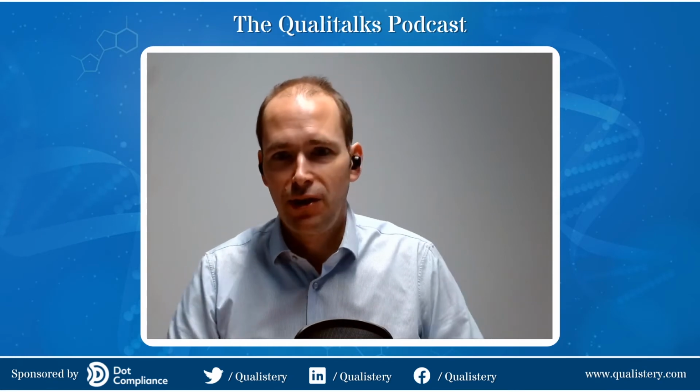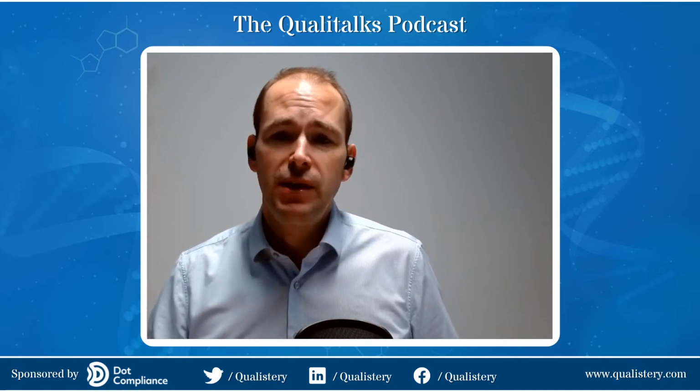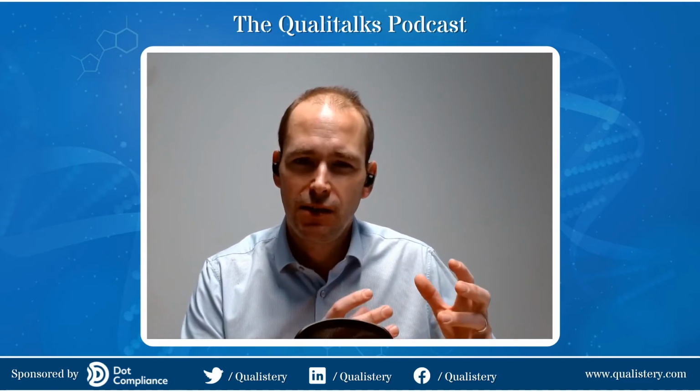So once we've closed out the OQ and we've done all of that testing, we then move on to cycle development. Now, this is something that's not always performed, but it's recommended, particularly for complex loads, for fluids loads. We need to understand a few things, really. First of all, are we sterilizing all of the locations within a load? So we'll look at actual loads that are going to be used for production. We want to make sure that things like long lengths of tubing, filters, anything that we might expect to cause us an issue, is being sterilized effectively. So we're getting the right amount of time and temperature. And to do that, we can then start tweaking the cycle to make sure that it's set up for those specific loads, that we're getting the best results possible from that.